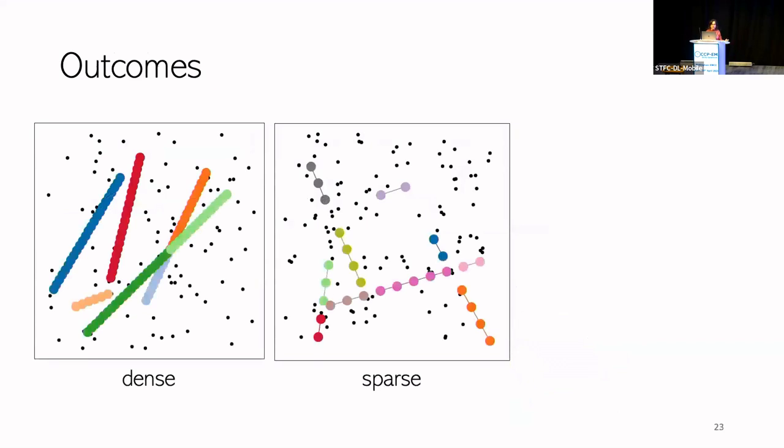So if we look at filaments, for example, in this sparse data, or this dense data, in the dense one, you can see that the filaments are quite well defined. But in the sparse one, even though the nodes are quite far apart, it still learns some of the objects, and some of them are still separate, and I'll get to that. But the idea is this.